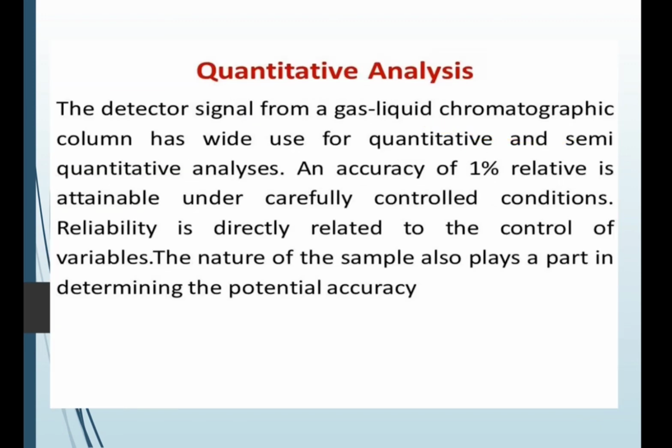Now we will see the quantitative analysis. In the quantitative analysis, we can measure the peaks with accuracy, and this data gives us reliable results.